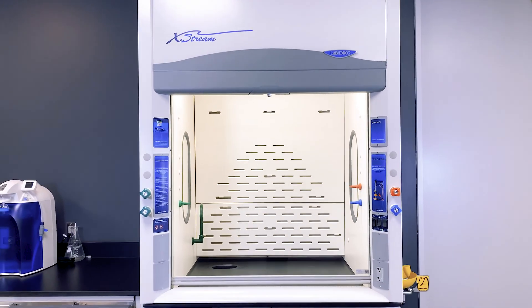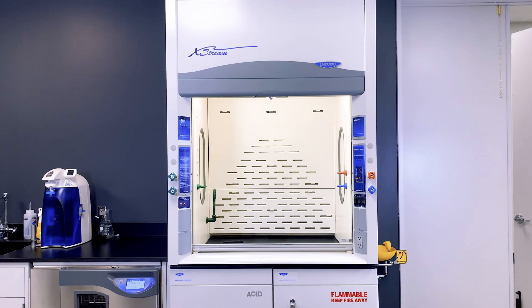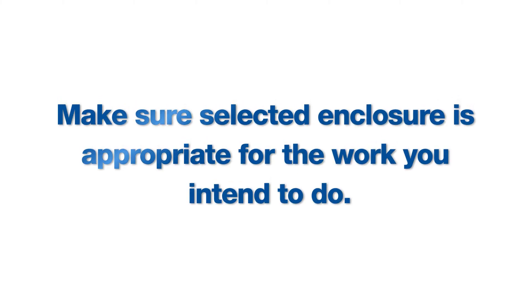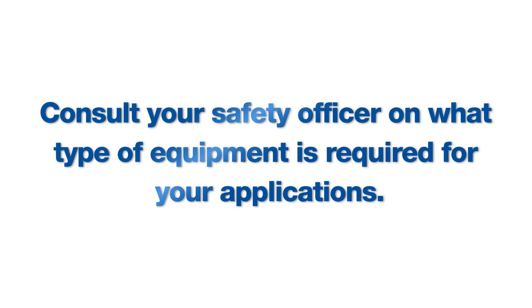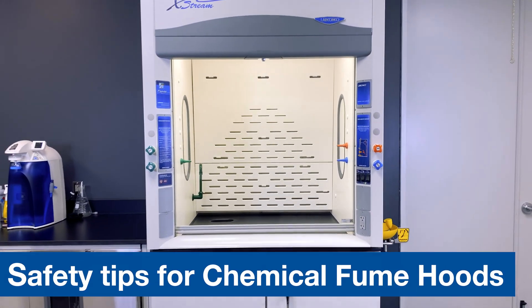Your LabConco fume hood is a safety device designed to keep you protected while working with dangerous fumes, gases, vapors, aerosols, or dust. Make sure the selected enclosure is appropriate for the work you intend to do. Consult your safety officer for a reference on what type of safety equipment is required. The safety tips in this video apply to chemical fume hoods specifically.